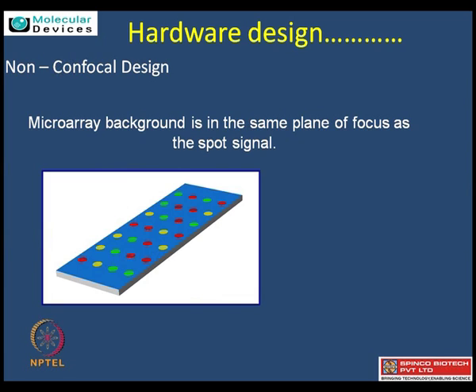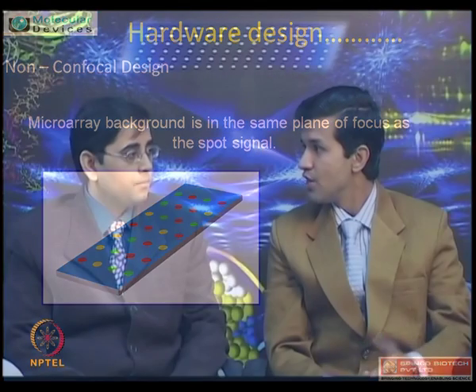Say when you go for tissue arrays or analysis where the spot size is very high, especially at the level of imaging of scanning images, there at the level of microscopy, people use a technology of confocal microscopy so that they focus the laser at different wavelengths, so at the end of the day they build a 3D image.